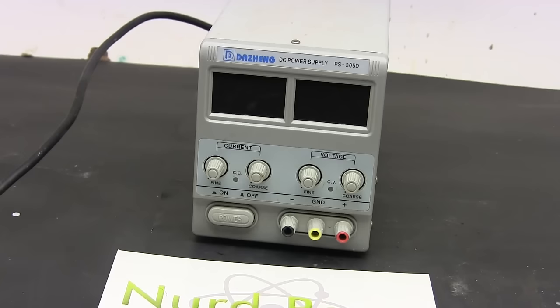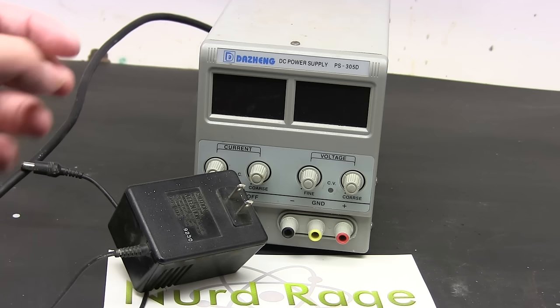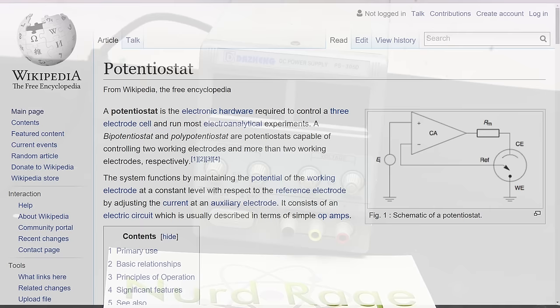Mine can produce 30 volts with a maximum current of 5 amps. This is about average for bench top power supplies. Anyway for most chemistry 30 volts is just fine. Now the one you see in the video cost me about a hundred dollars and to be honest this is ludicrously overpriced. You can get away with just a power adapter and a step down DC-DC converter module off eBay for a total of ten dollars or so. Far cheaper and lighter than this overweight monstrosity.